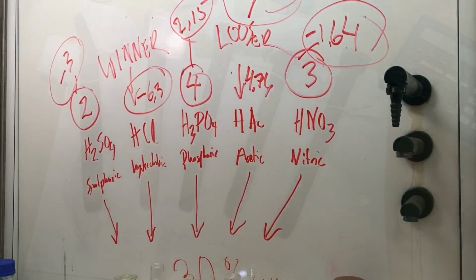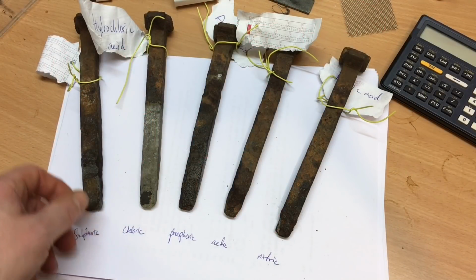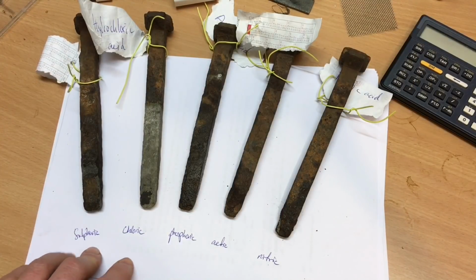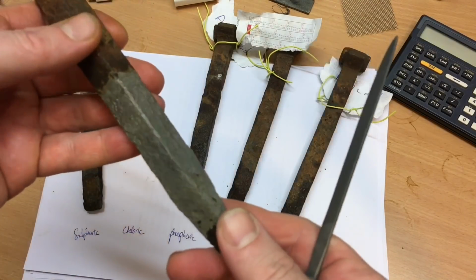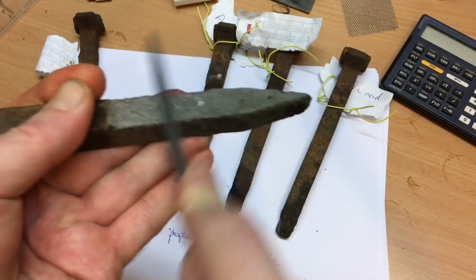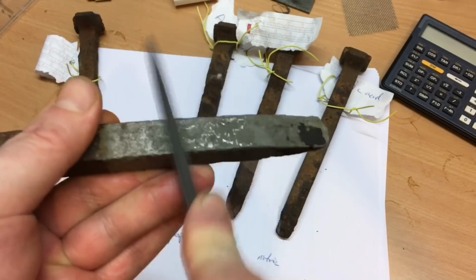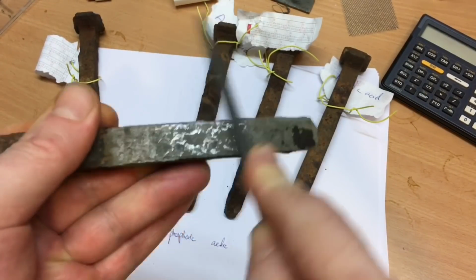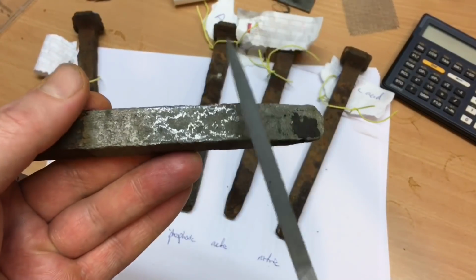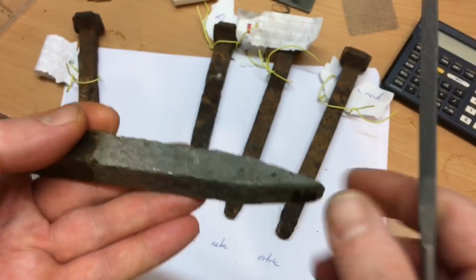Have a good day. Finally, here you can see all the rusty nails as they come out after the reaction. And they are put in the same order as we had them in the laboratory cupboard. And it appears that it's a little bit dull in the surface. But if I take a tool and I sand it down for a little bit like this, then you can see the iron coming out as shiny.